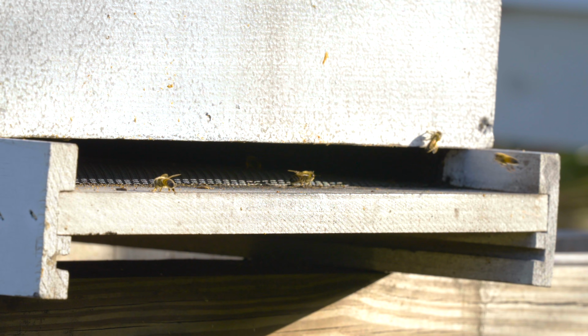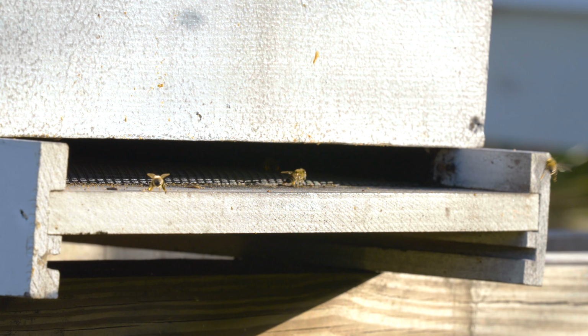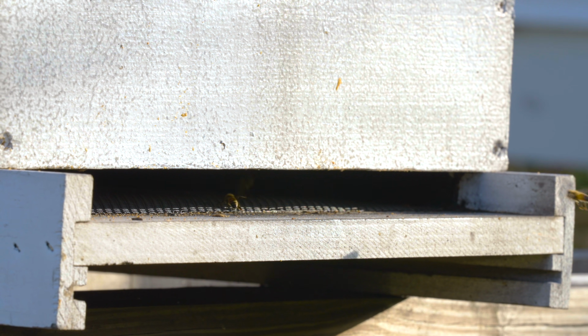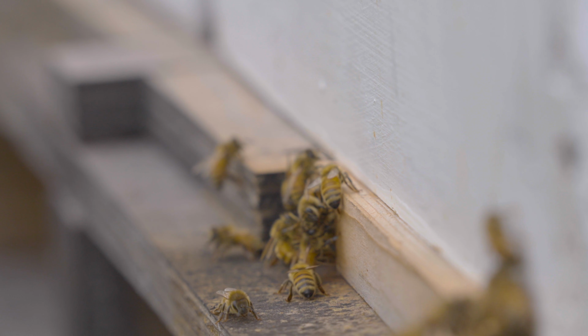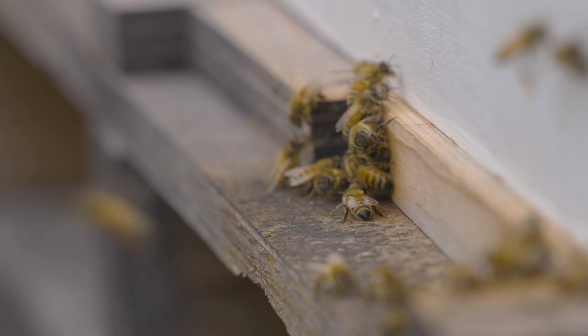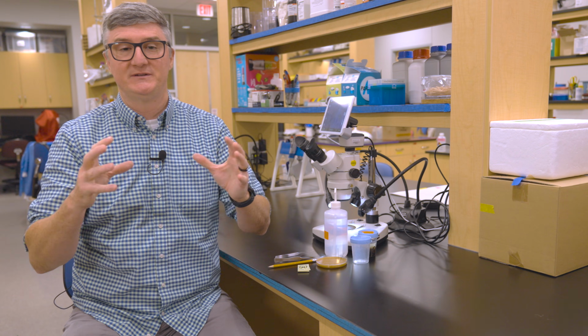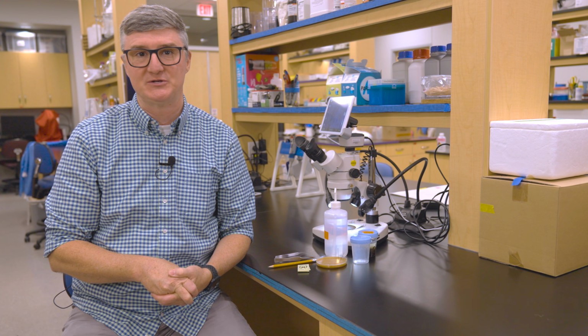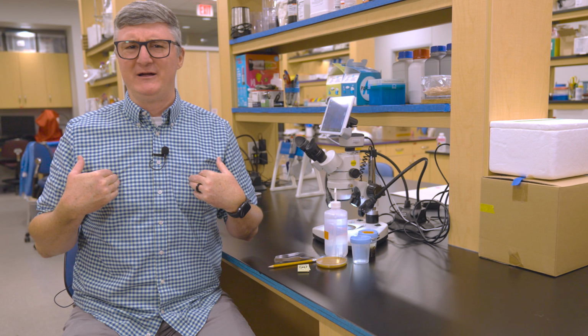First, you can block the entrance of the hive so that all the foragers that are coming back are unable to go into the hive, and now you've got this assortment of foragers hovering around the nest entrance. With an insect net, you can just sweep across that nest entrance and you can have all of those bees ready for tracheal mite dissection. I don't typically do it that way myself.